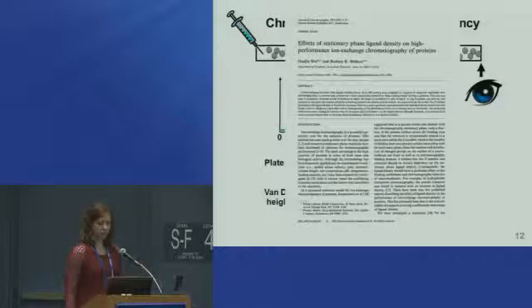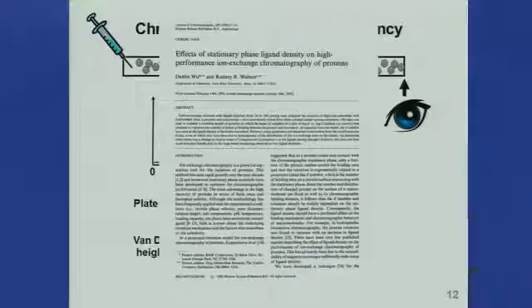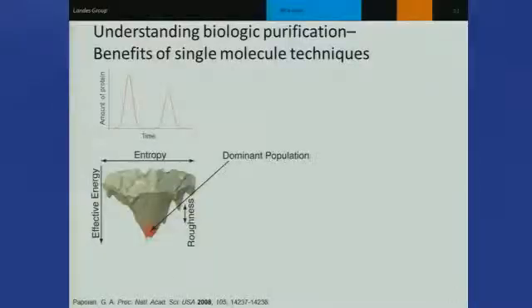And some of our inspiration came from this paper from Wu and Walters that was published in '92, I believe, using some more standard techniques, of course, because it was '92. In terms of ion exchange, which should be purely a coulombic and electrostatic interaction between the analyte and the column, there's some sort of denticity there, a multivalency more appropriate to something like affinity chromatography. So there's something more complicated going on, with multiple binding-type interactions between a protein and the ion exchange column. But we like to be able to look at this at the level of understanding how an individual protein and individual ligand interact.